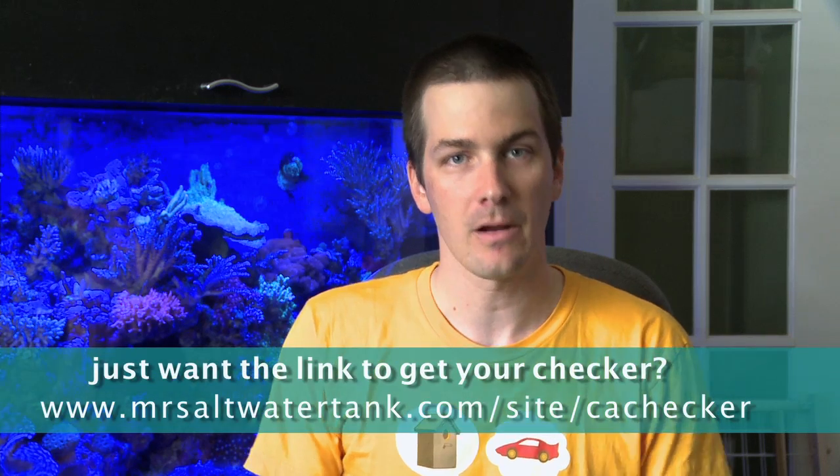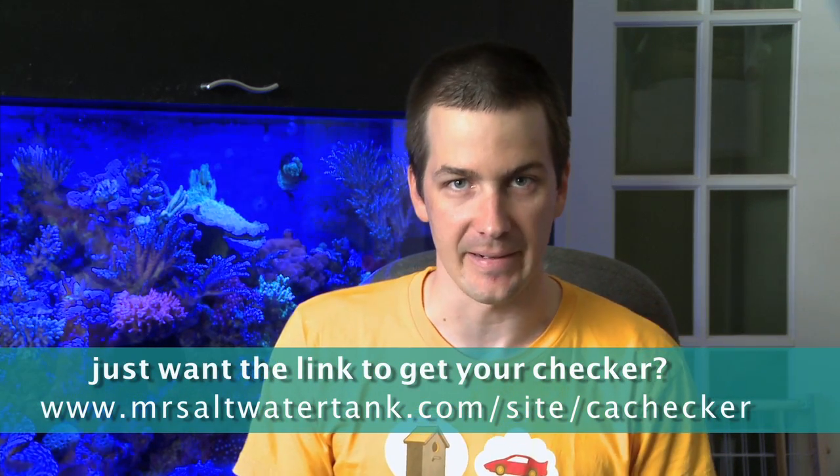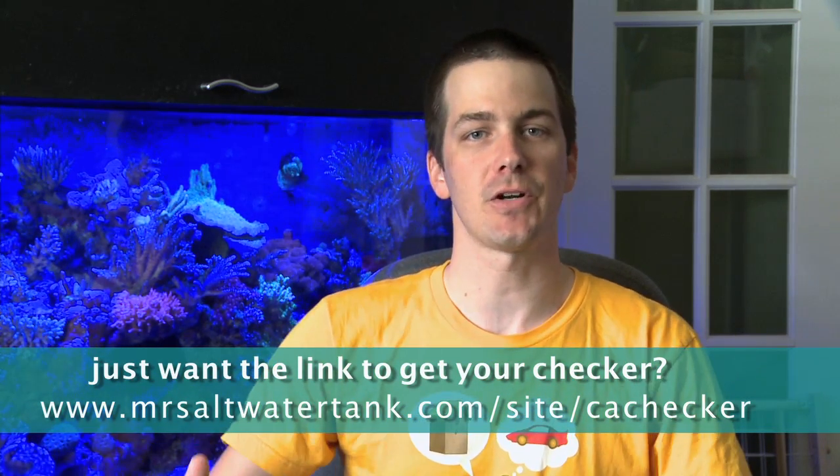Today I'm going to show you the HANA Checker, show you the steps that it takes to run the test, and give you my feedback on it. And with that, let's get started.